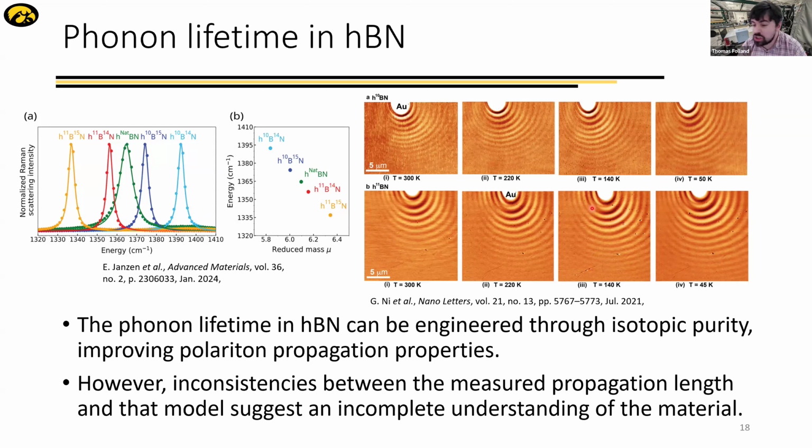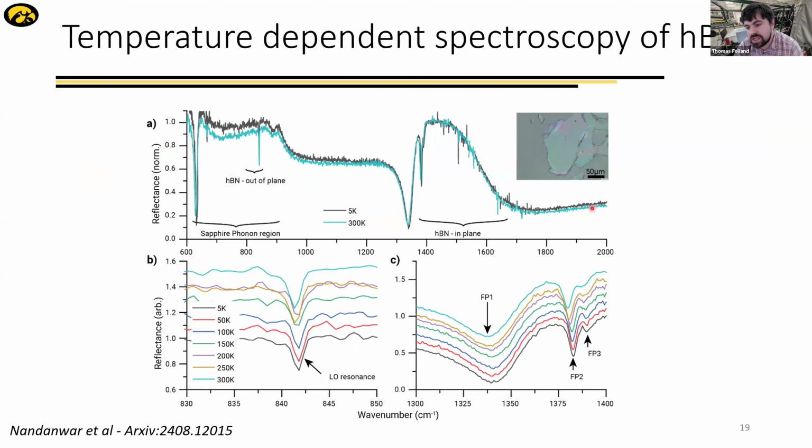But when you just measure a polariton, not the material itself, it's hard to distinguish what part of the polariton comes from the material, versus what comes from light, versus what comes from something emergent that comes out of the fact that you've created this polariton. So one of the things that we did recently, as part of benchmarking our system, is really look at the optical properties of boron nitride as we cool them down to very low temperatures.